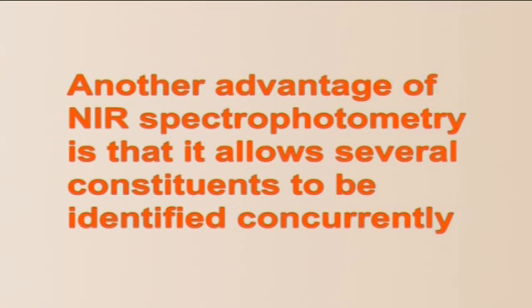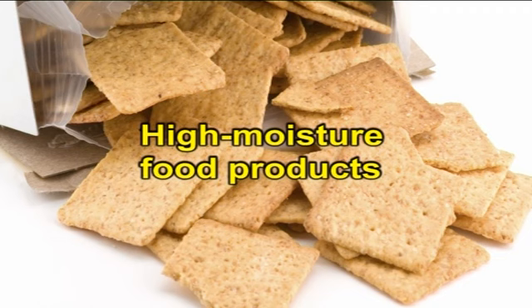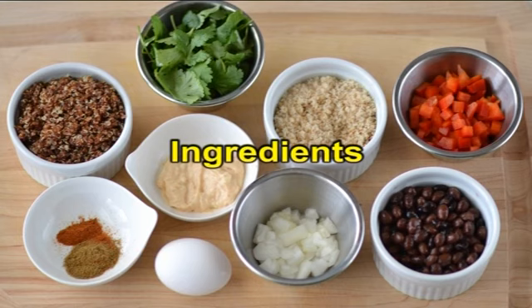Usually, no sample preparation is necessary and the time of analysis is not greater than 1 minute. Another advantage is that it allows several constituents to be identified concurrently. But the disadvantage of this technique is relatively weak absorption due to high moisture in food products and ingredients.